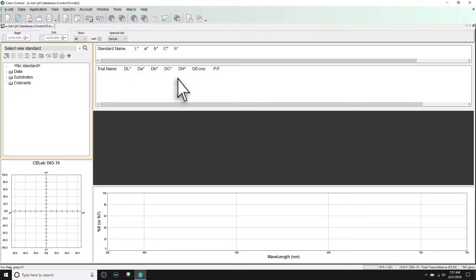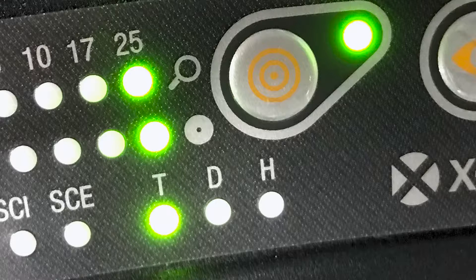Before taking measurements, ensure that the correct configuration is loaded and calibrated. The transmission indicator will illuminate on the front of your instrument based on your configuration.